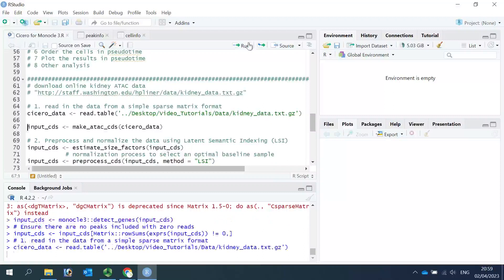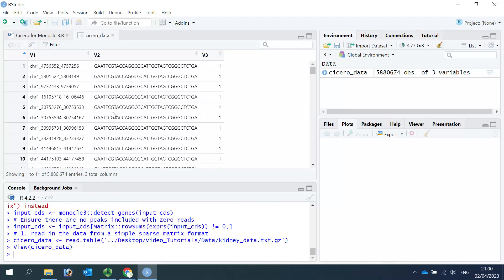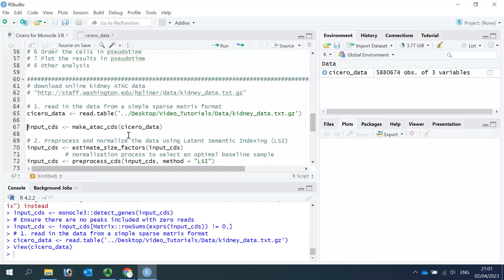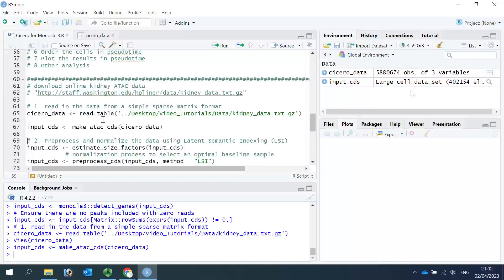Let's read the data in and click the data to have a look at what kind of information is in the dataset. You can see the row names are numbers, and we have three columns: the first column is the peak names, the second column is the cell barcode, and the third column is the count. The count for each peak is one. Now we can use the Cicero function to make an ATAC-seq CDS object, which we name as 'input_CDS'. You can see in the data window we created a large cell dataset.